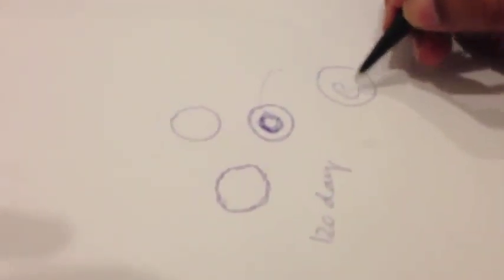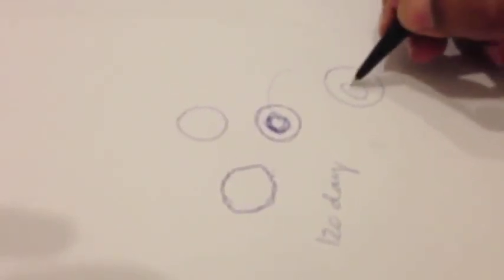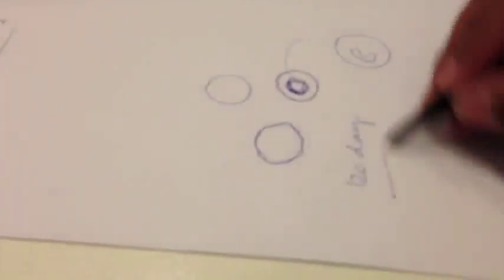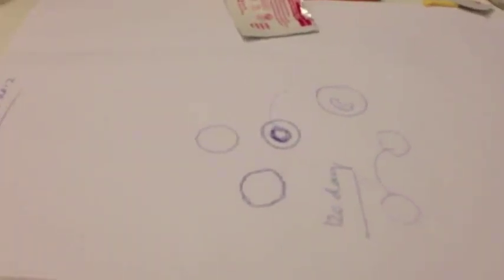Some cells we see on the video have kind of like a fluid brightness, not completely circular. That means they are repairing. So quite a few cells are repairing, and especially after a workout, you'd see a lot more damage. You'd see 120 days from start as well. 120 days for a red cell to completely turn over. And I've been doing it for 90 days so far, to the day almost. So in another month, you will see much better.